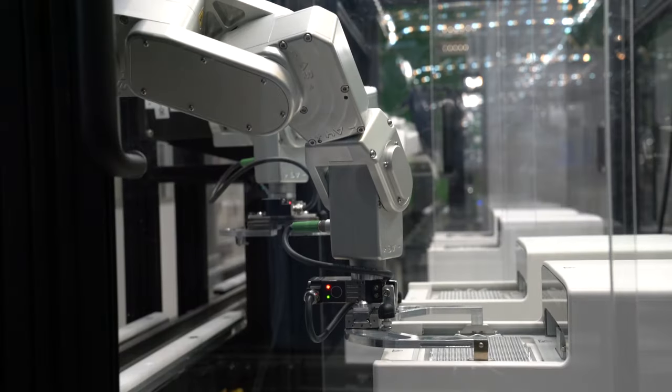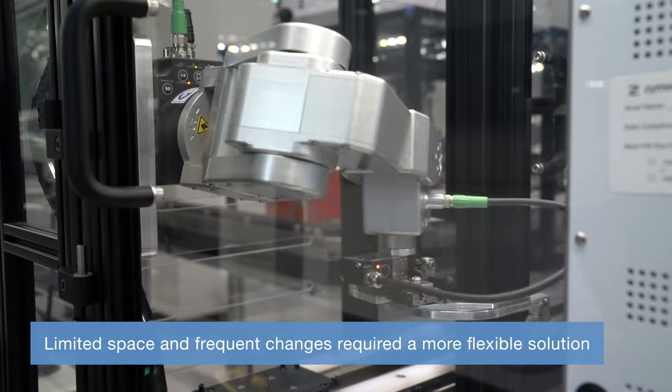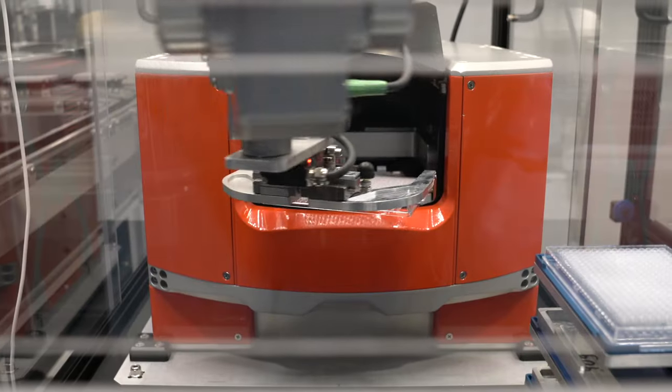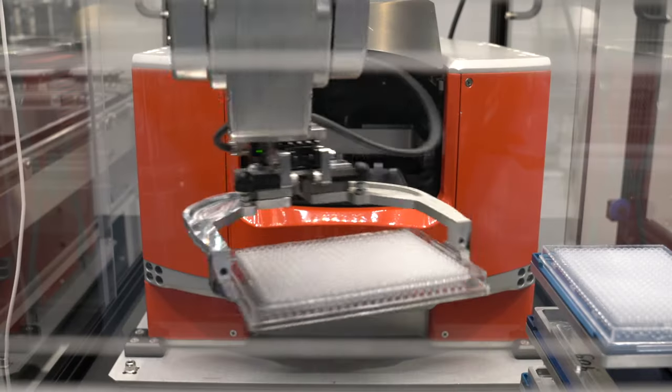We also have the issue that a lot of our biological processes change a lot. Our teams change, our building changed, the space constraints change, and as a result our automation equipment needs to fit in different size spaces. And if we have one big robot that's surrounded by a bunch of instruments, that space that takes up is very inflexible and it takes up a very large volume.